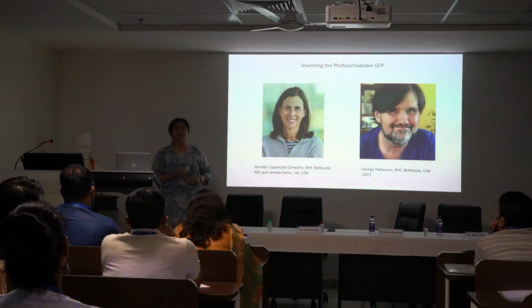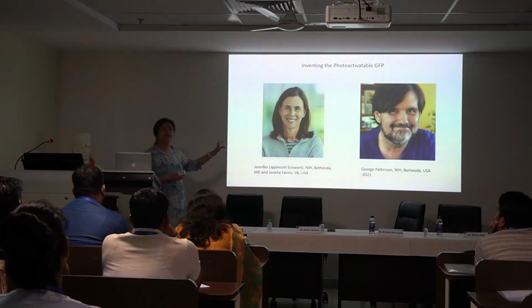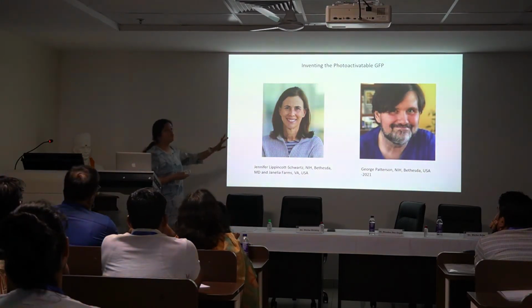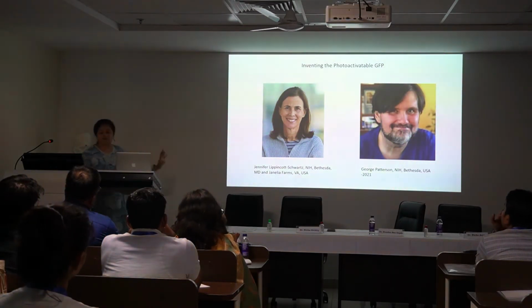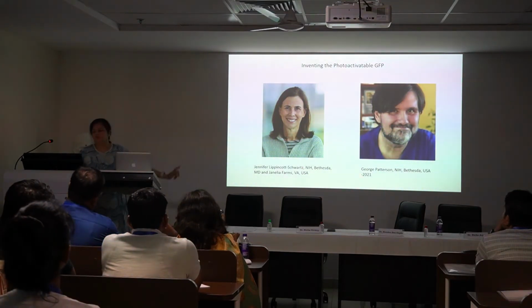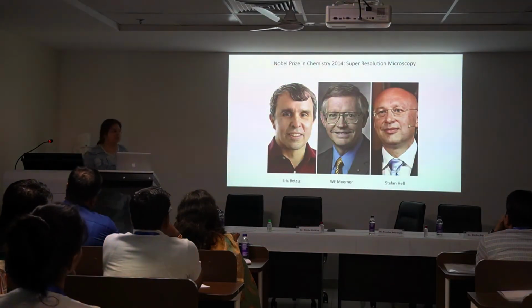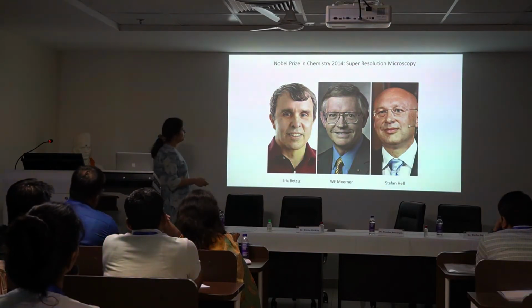Right, there is a PA-Cherry out there, which is fine-tuned by him to work better for many different applications, and there's a PA-GFP out there, which is again fine-tuned, all of these photoactivation tools for many different applications. So they had developed this tool, all right, and remember that Moerner. So I'm going to shuttle between photoactivation principles for super resolution and just live imaging back and forth.